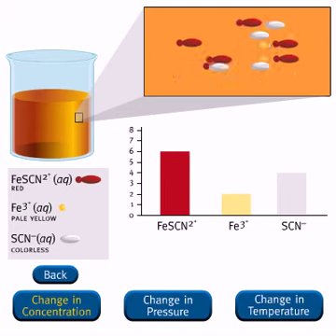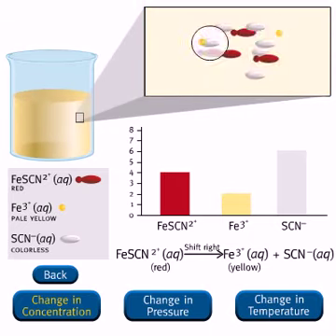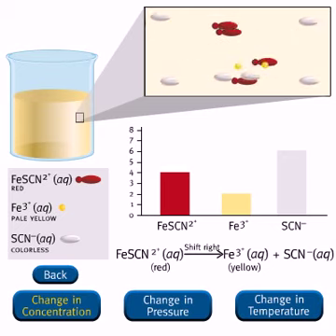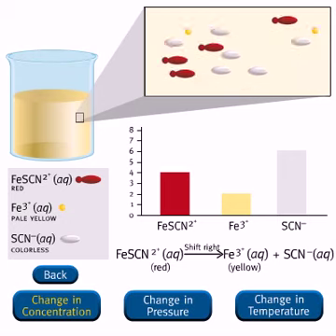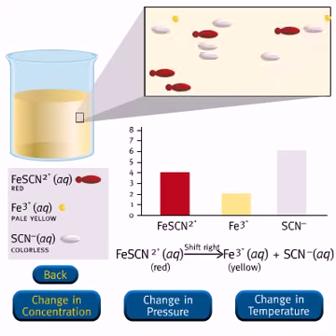Oxalic acid ionizes in water to form the oxalate ion, C2O4 2-, which binds strongly to the iron 3+ ions. Free iron 3+ ions are removed from the solution as the stable yellow ion iron(III) oxalate is formed. The system shifts from left to right to replace some of the iron 3+ ions.